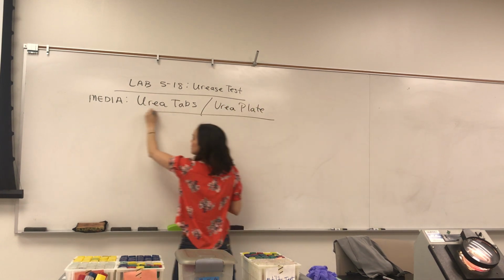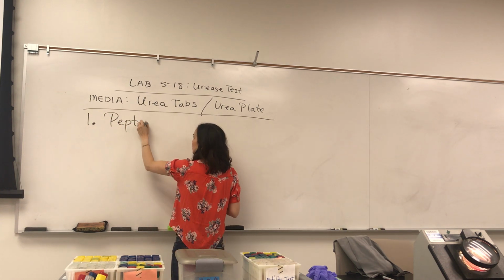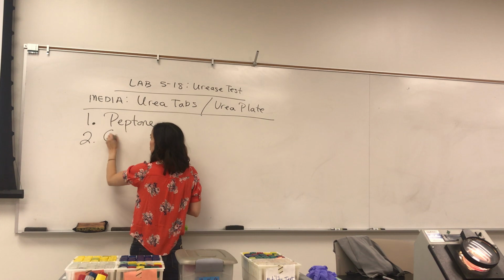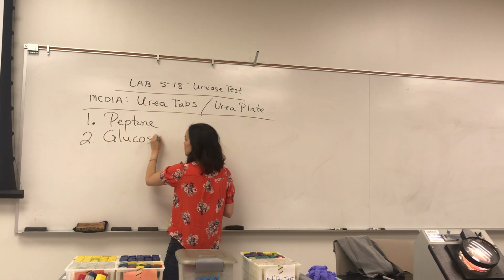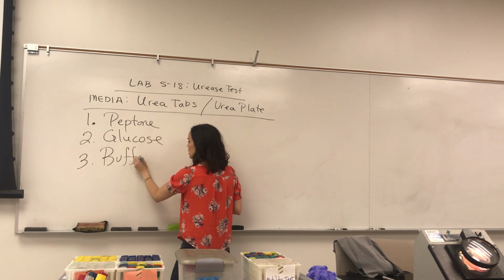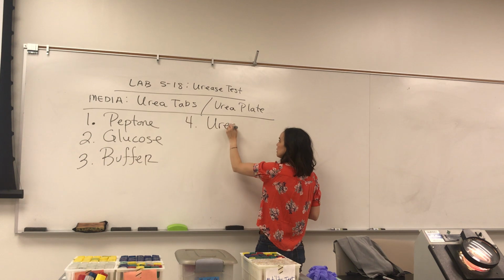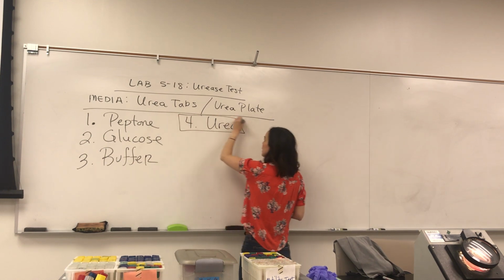The ingredients are the same though. So there's peptone, there's glucose. Technically there's some buffer that we're going to mention that's thrown in there. There's urea. Urea is going to be our focus.